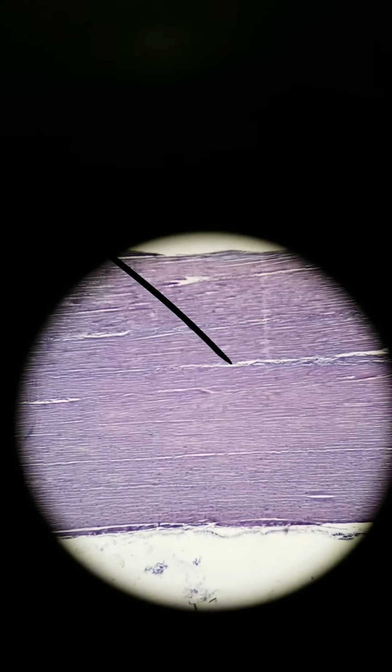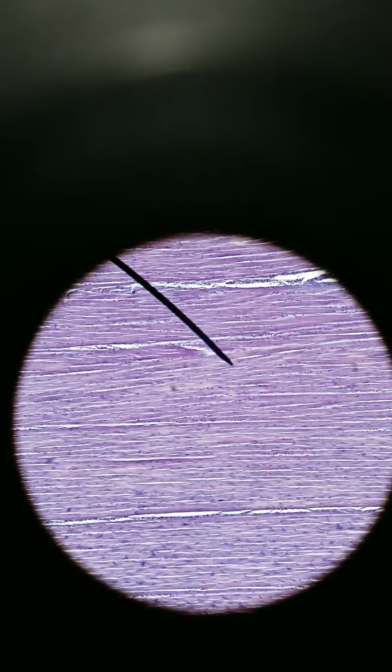Those were the three loose connective tissues, and they're called loose again because you saw some white space in between them. Already with this one, you can see that there's pretty much no white space in between the fibers, in the extracellular matrix. We're at 40x total, 100x total, 400x total. So what we can see here, there are nuclei, and those are nuclei of fibrocytes.